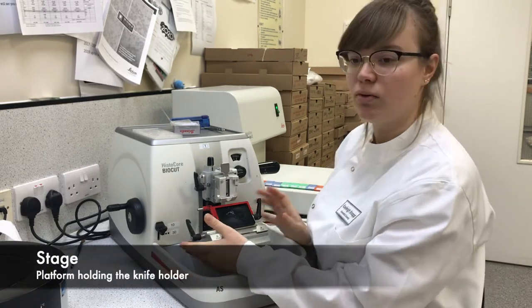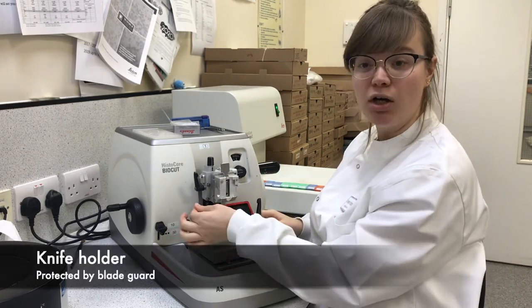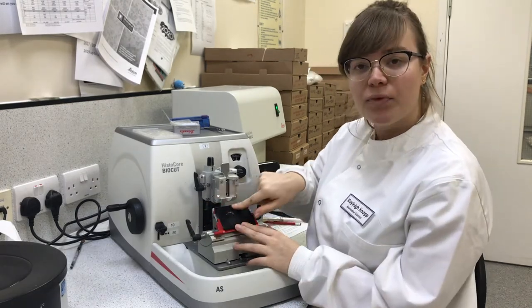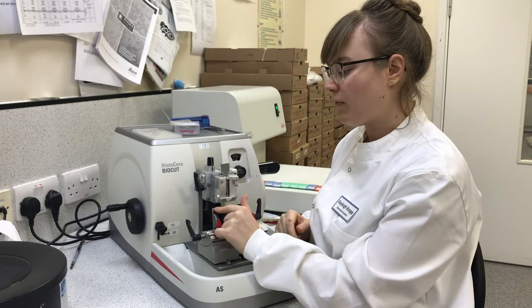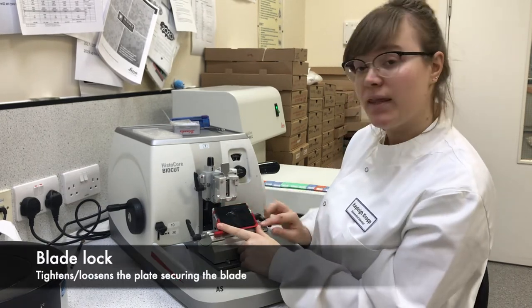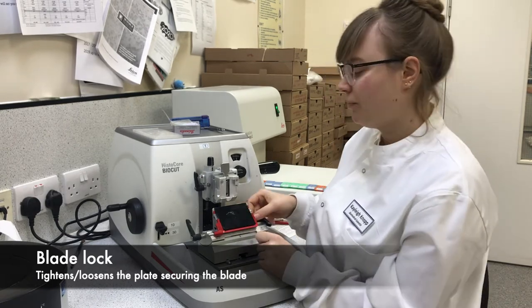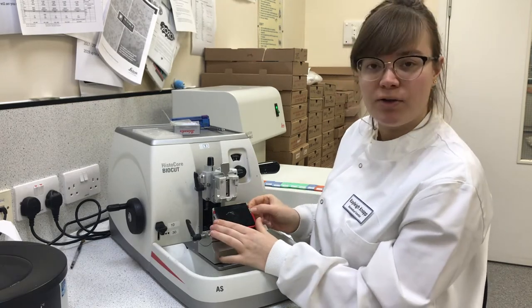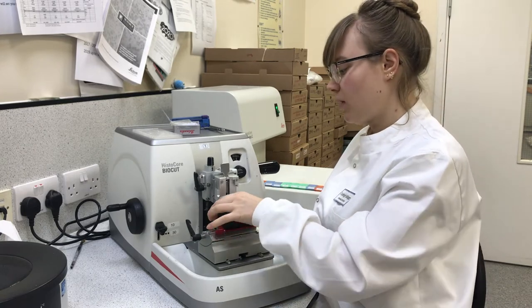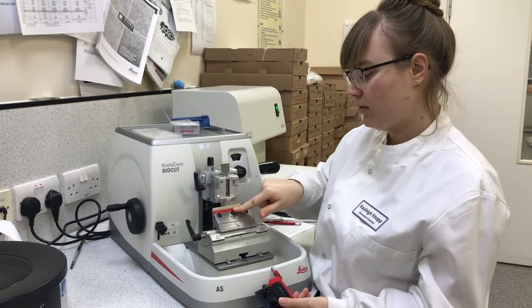This is your stage. This is your knife holder and your blade guard — this goes up for safety across the blade. This slot here holds your blade. At the moment I don't have a blade in here. This plate here is loosened by this lock — locked, unlocked. To take this plate off to clean, take this out. Some microtomes will also have this locking bolt. This comes off when you need to clean, then you can clean all in here.